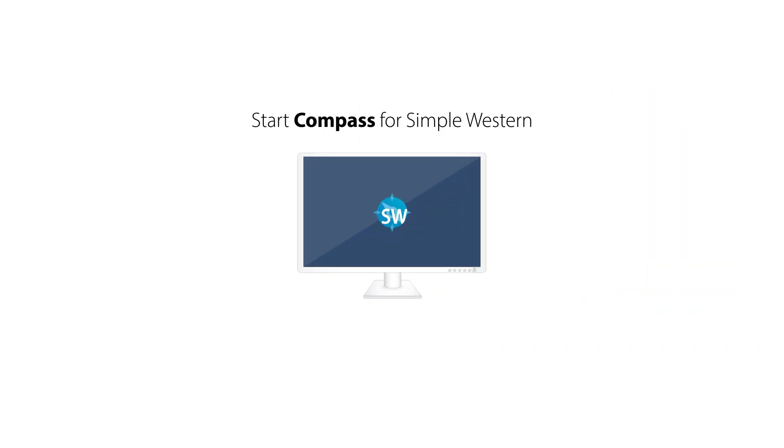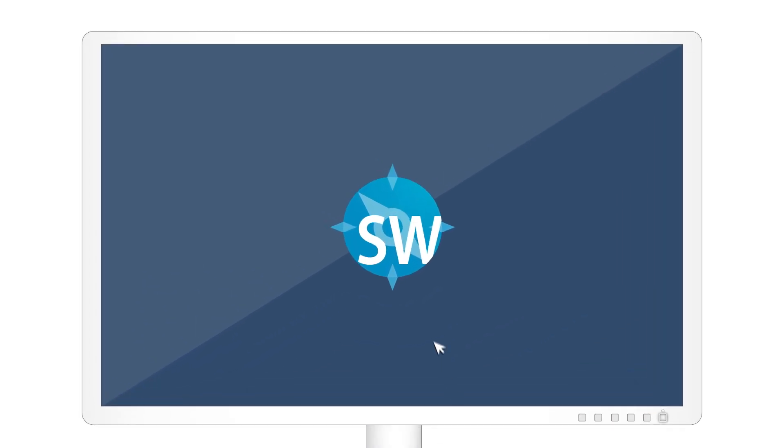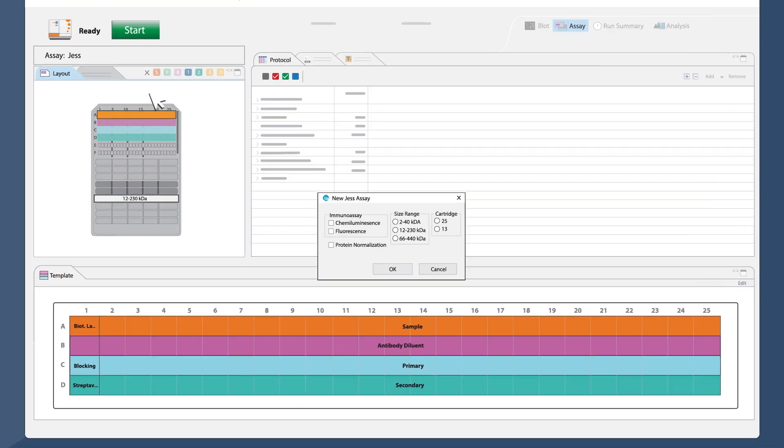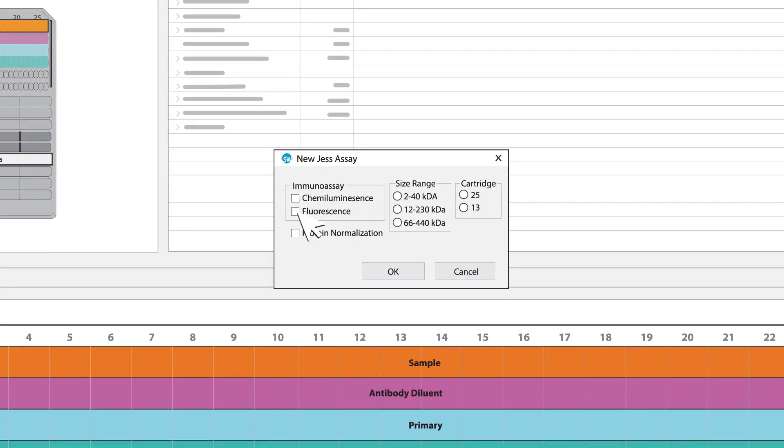Start Compass for Simple Western by clicking on the shortcut on your desktop. Select File, New Assay, Immunoassay, Fluorescence.